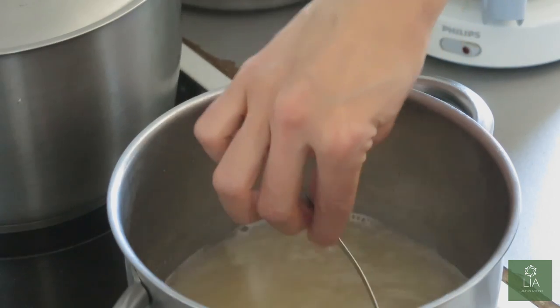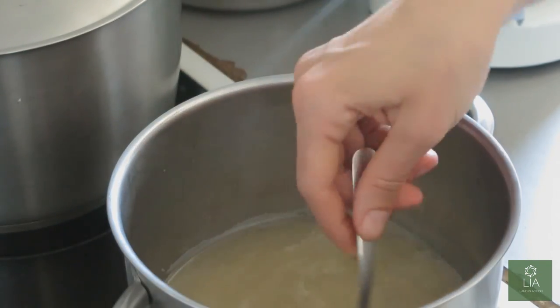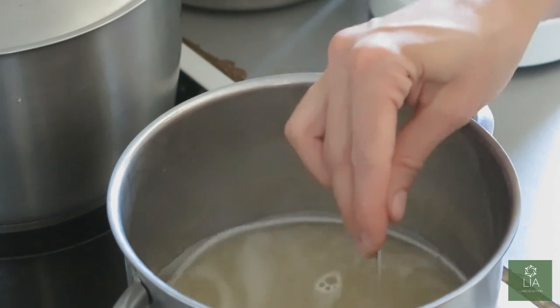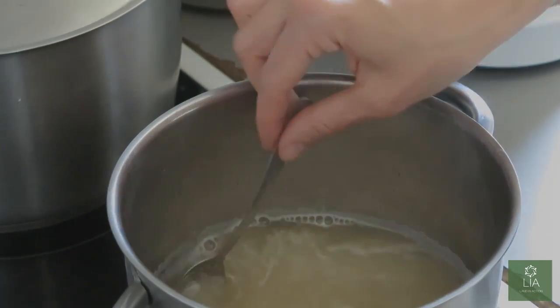I've warmed up the jar because, of course, this is going to be hot fluid going into a cold jar, and you've got a good chance of cracking the jar. So always warm the jar first before you transfer the agar into it.